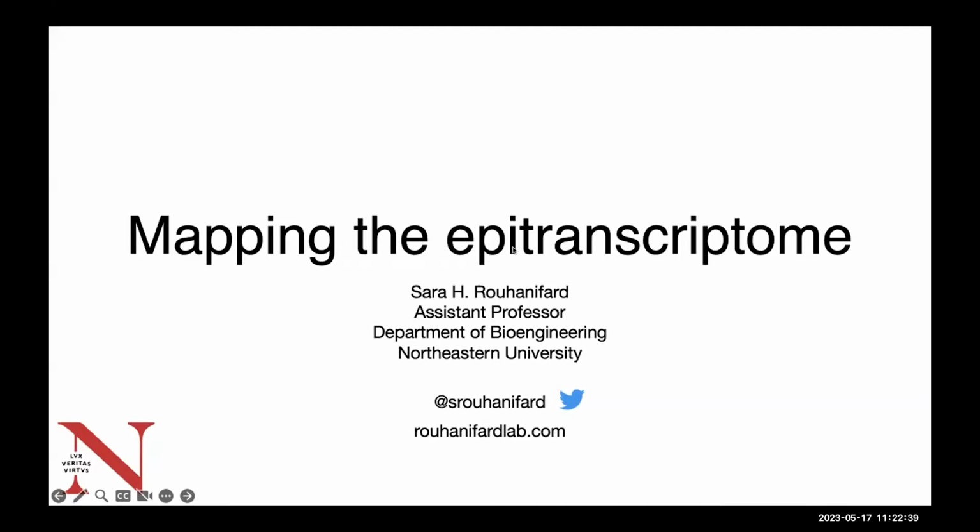Hi, thank you to Mark and the TDCC for organizing this event and for the invite. And thanks to Ya-Ming for a really amazing introduction to the important biology of RNA modifications. So now I'll start to tell you about some of the challenges and opportunities, I think, in mapping RNA modifications, specifically in messenger RNAs. This is what the focus of my talk will be about.